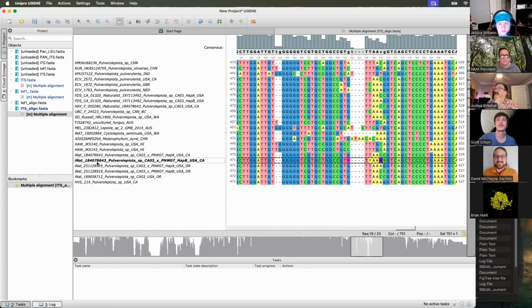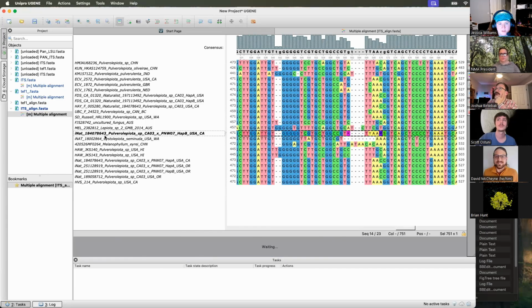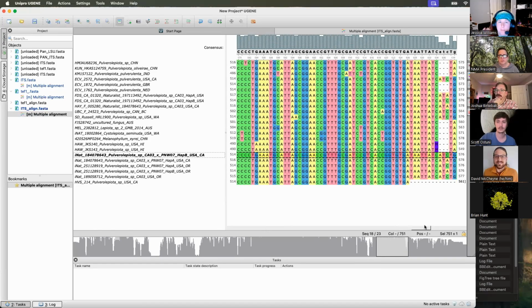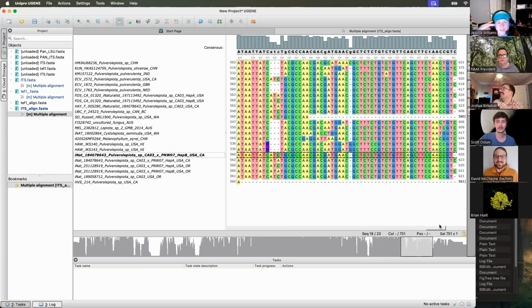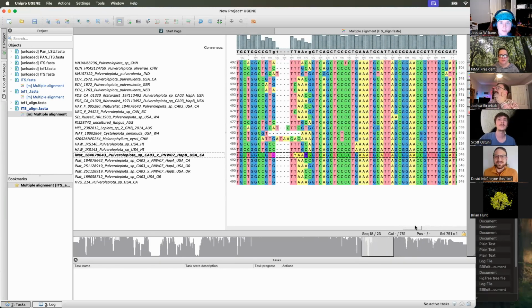Okay, here's something where I bet I messed up the naming and named this haplotype B because it has polymorphisms. I wonder if I messed this one up. Because none of your phased haplotypes should have polymorphisms in them, or do some of them? You're muted, Jessica. Sorry. There's like one that had a couple. It was probably just nanopore noise or something. Maybe right here in this little string. But I don't think it was that many.